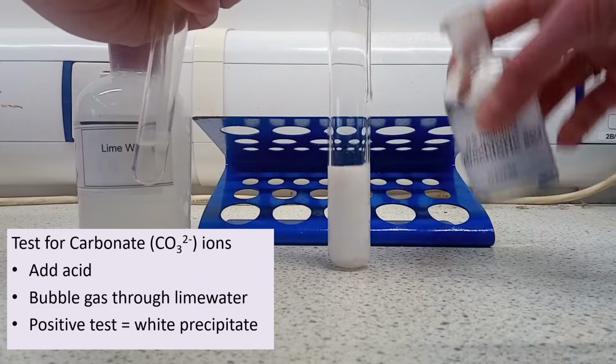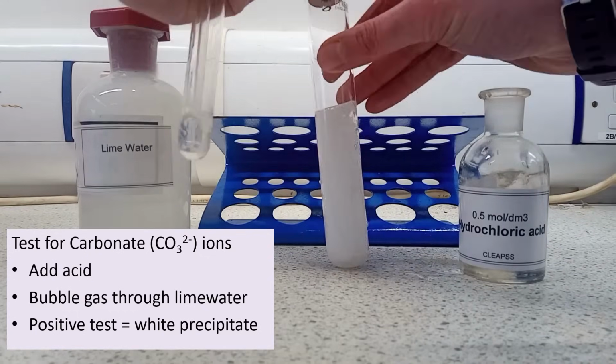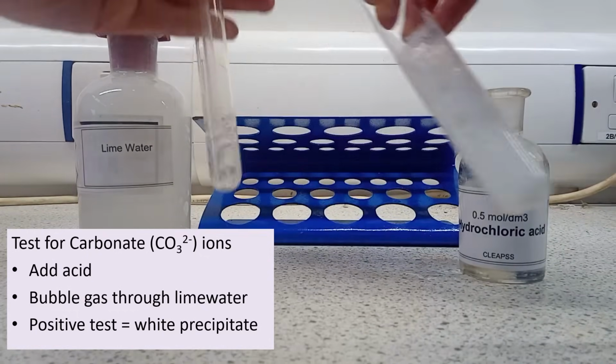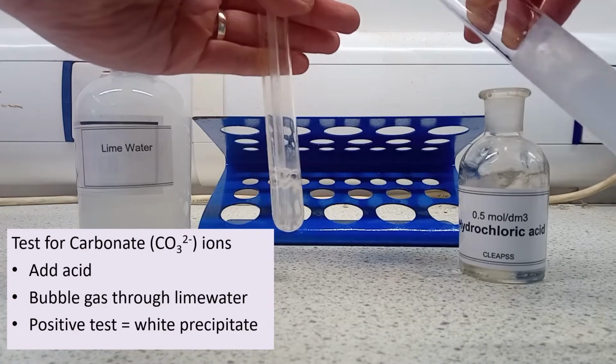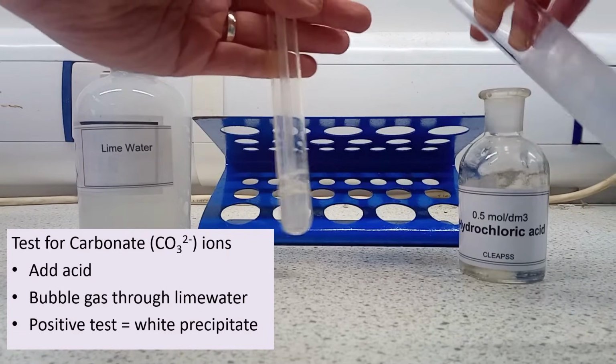To test for carbonate ions, I add acid, and as you can see it bubbles up, and I can pass those bubbles through lime water or aqueous calcium hydroxide, and gradually a white precipitate forms and that solution goes cloudy.